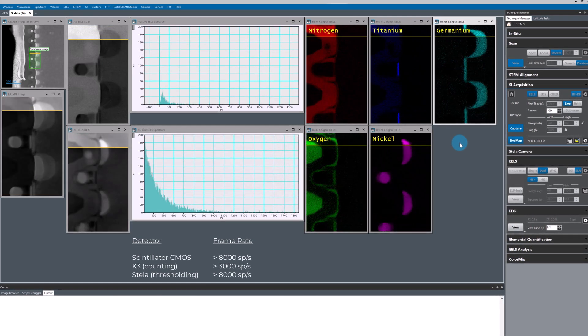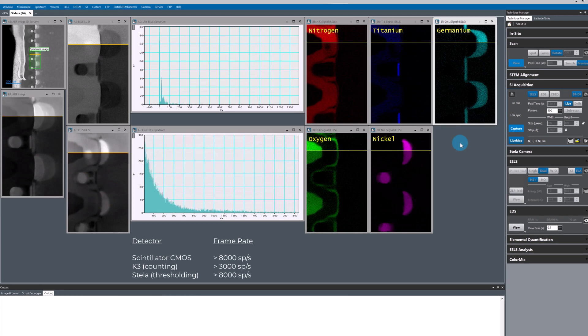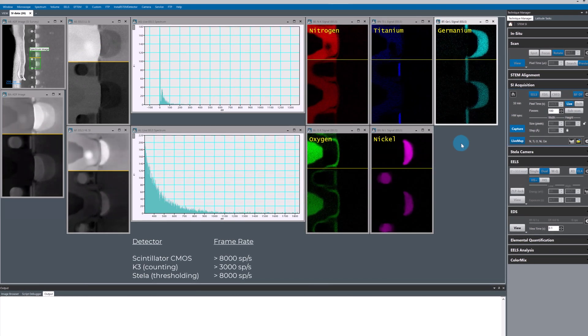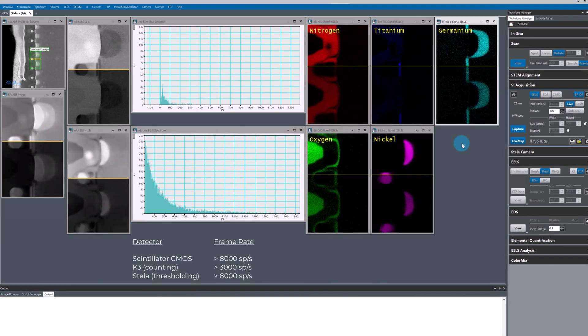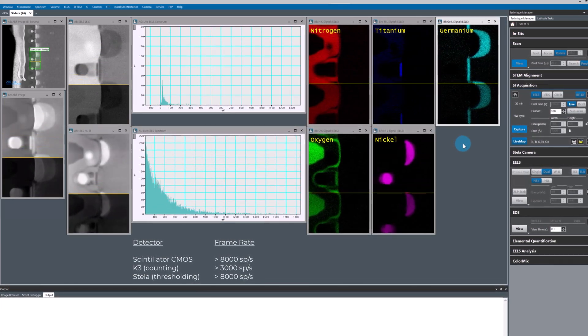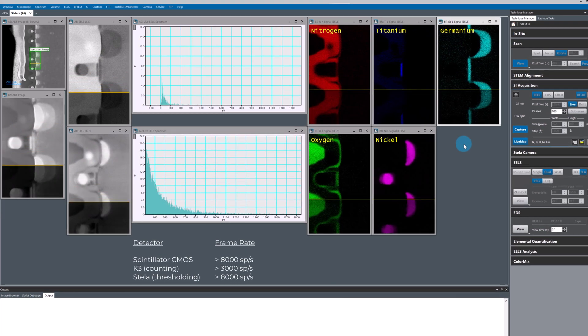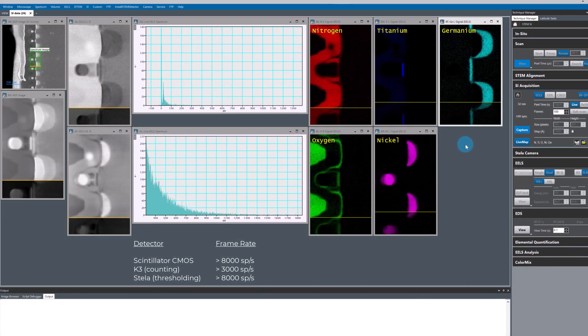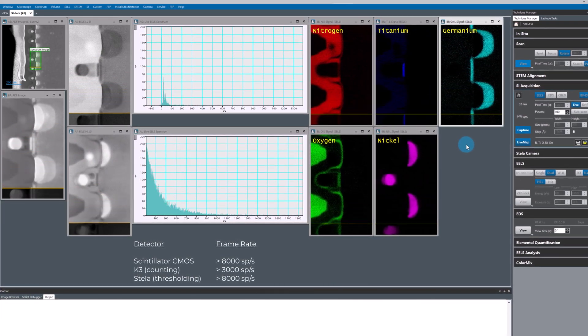I've got multipass scanning enabled and the software is currently set to scan 100 passes. I don't really need to scan this area 100 times to get good quality data.